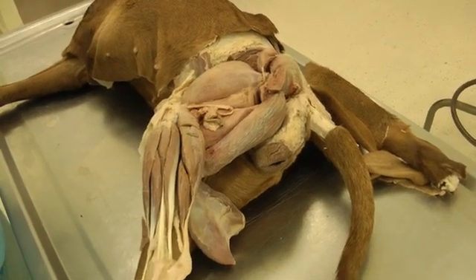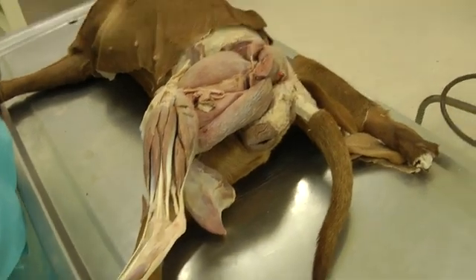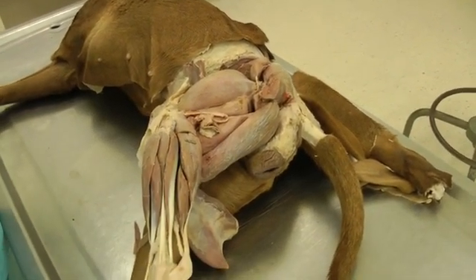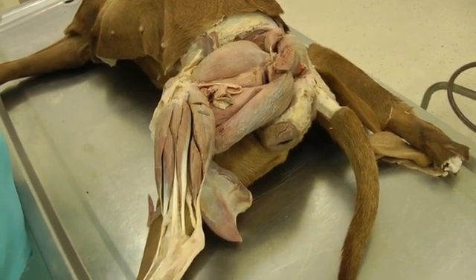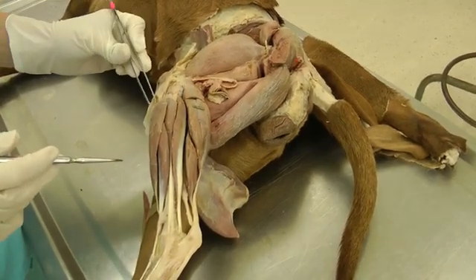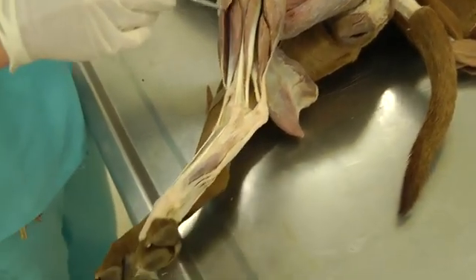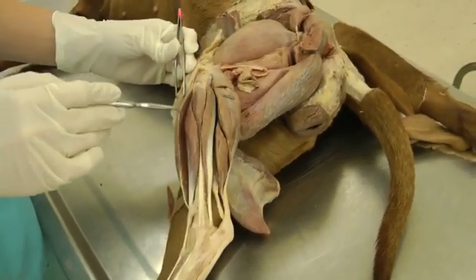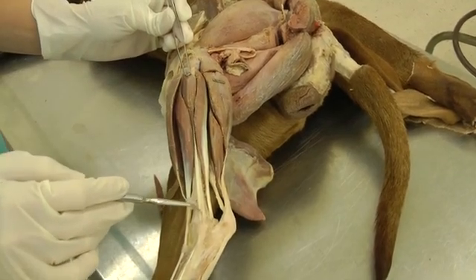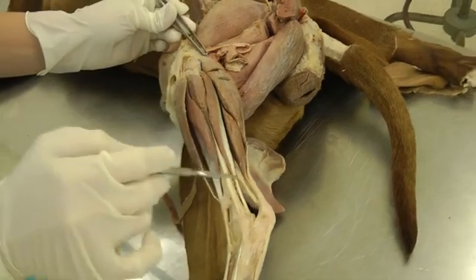This is lab 7 on the dog specimen. We are working still on the pelvic limb but doing some more muscles of the caudal aspect of the crus, and then a few items to do with joints. As a quick review, on the cranial aspect of the limb we have cranial tibial, long digital extensor, and fibularis longus. We've already done all of those muscles, so now we're looking at the caudal group.